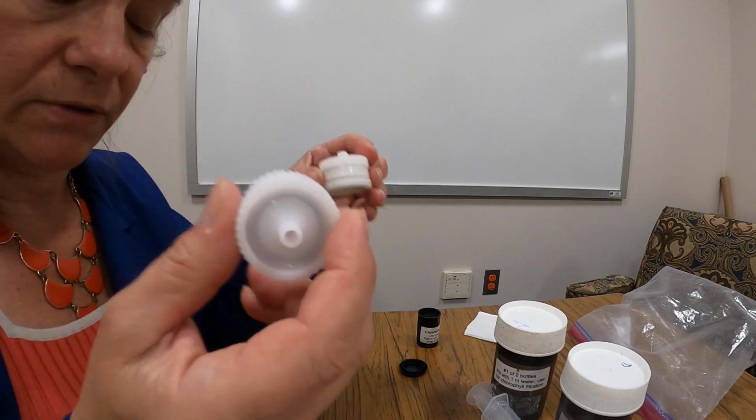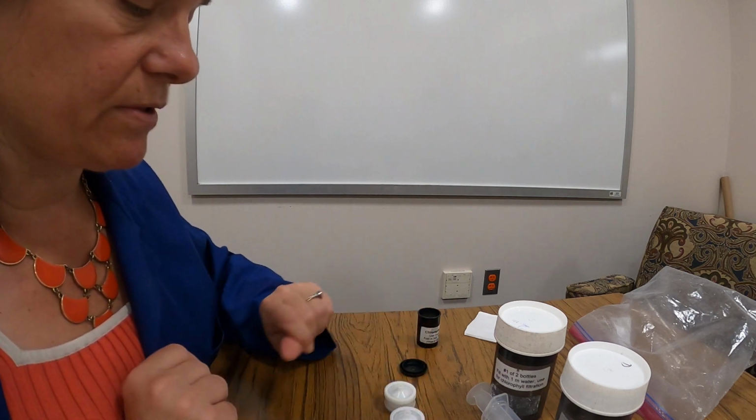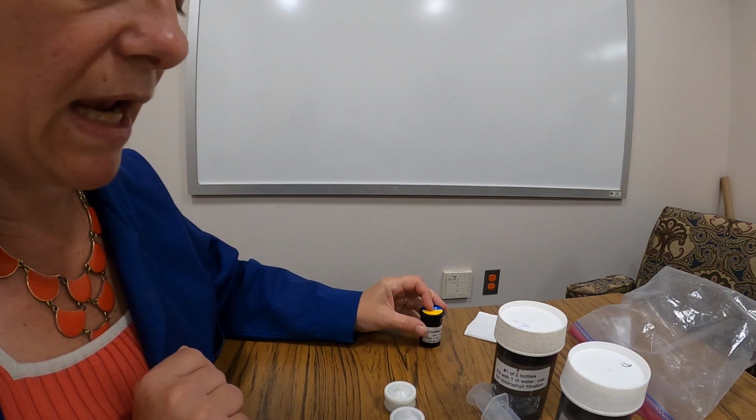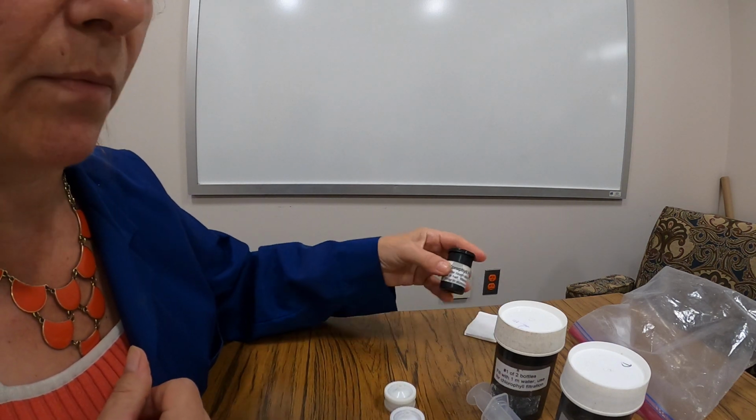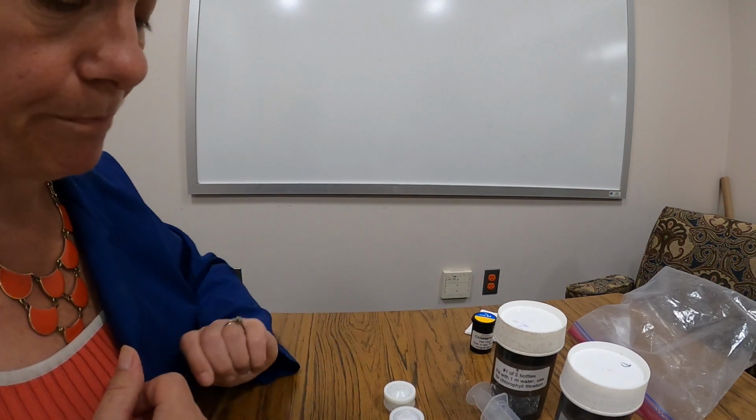So now my 2 filter holders are all set. I can put those aside. I like to always recap my filters in between so I don't knock it down, particularly if I'm working where it might be breezy.